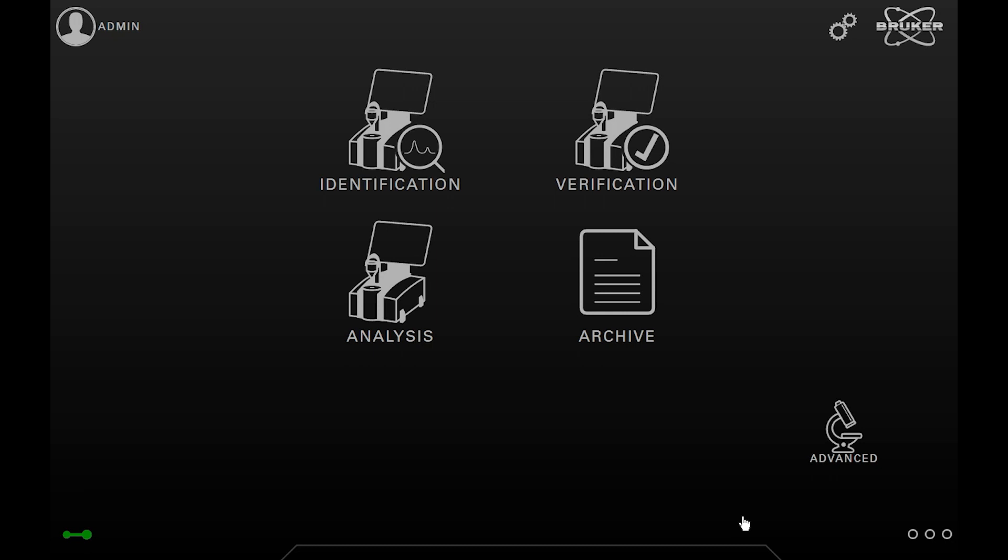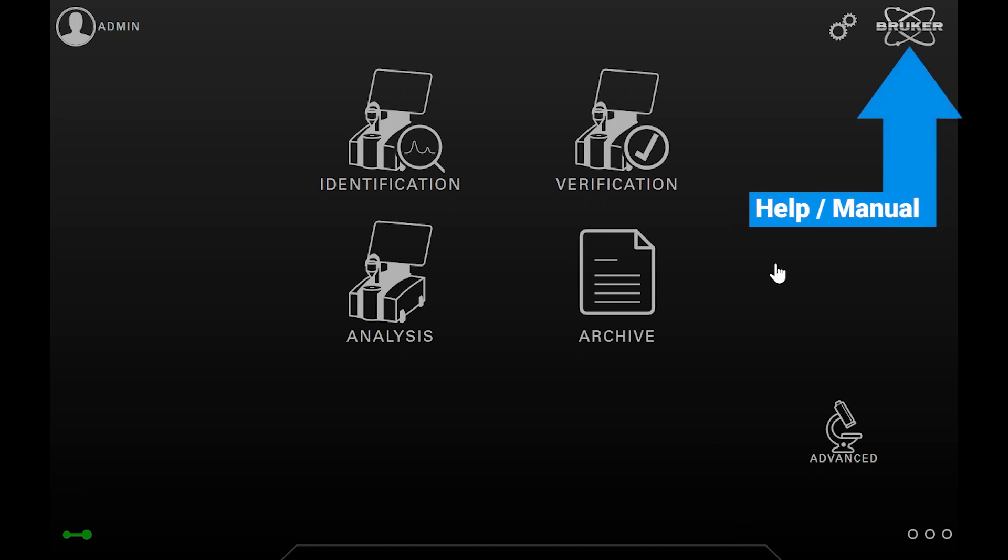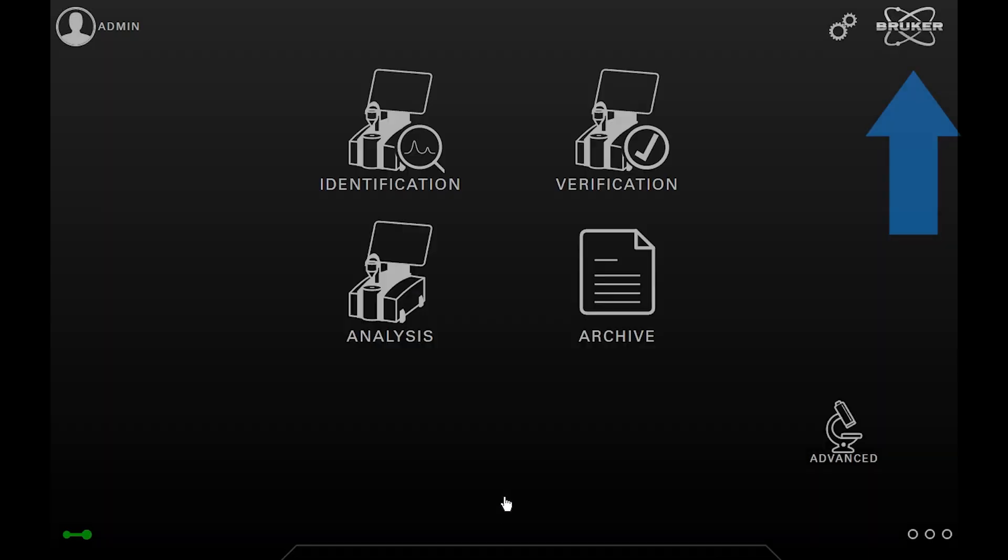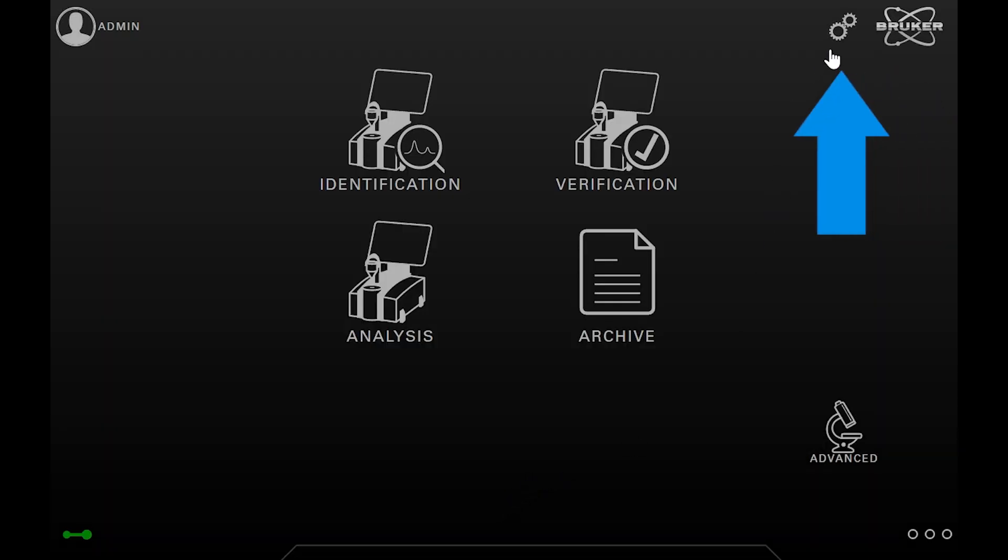For that, you can simply tap on the broker icon in the upper right corner. From here, you have access to both the software and device manual. You can also see basic version and registration info here.